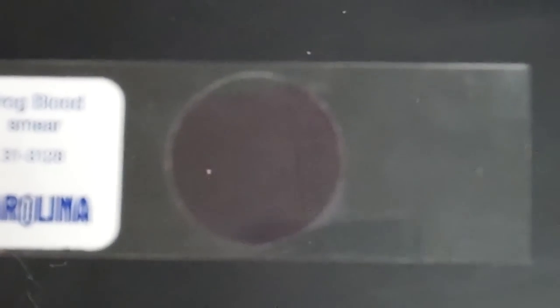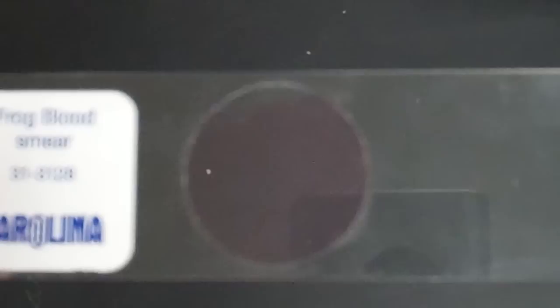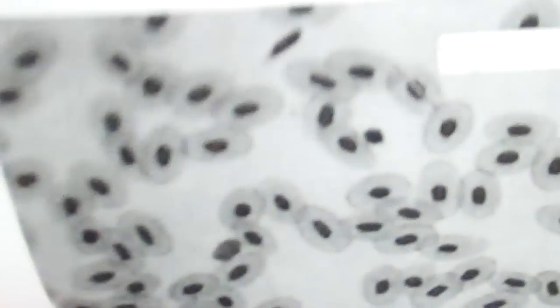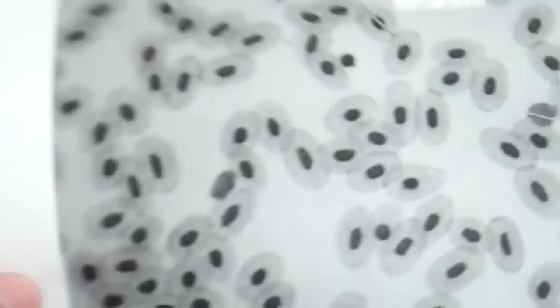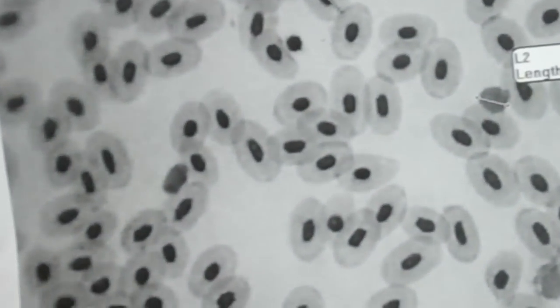I would start out on your scanner lens, your lowest power lens, and you're looking for pinkish circles. It might look like dots before you focus, but once you get focused you're going to see something that looks like this.